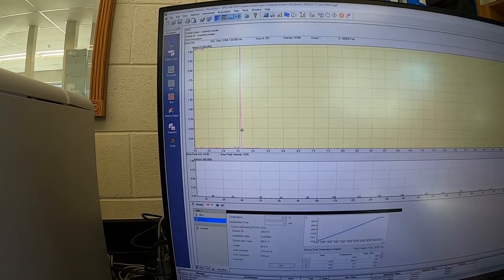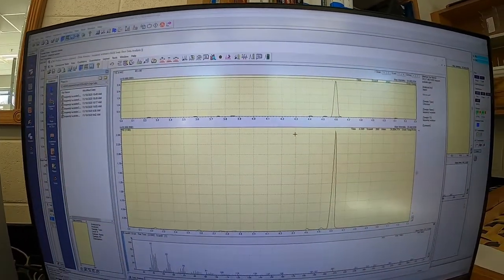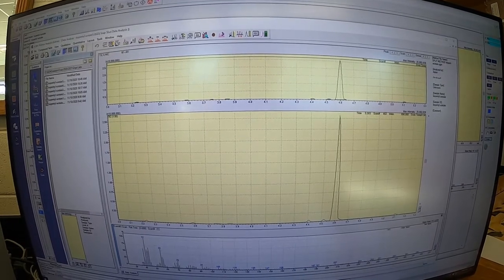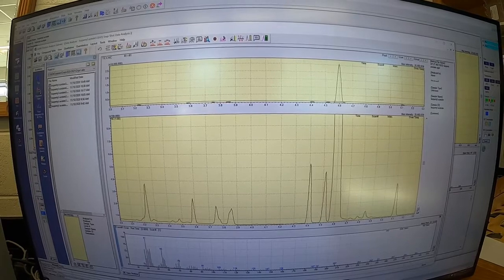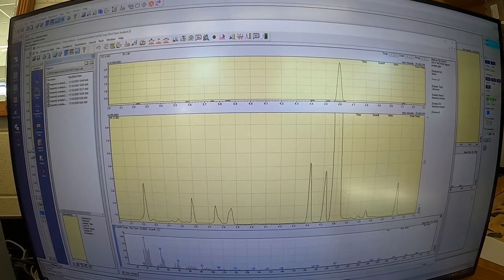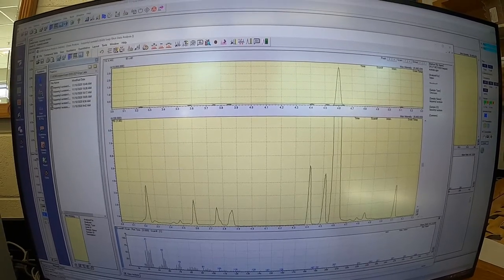So we can see one big peak there, and what I can do is go to the qualitative side of the software, and now it's a little bit more zoomed in. If I zoom in a lot on what's called the gas chromatograph side, we can see a lot of other little peaks. And those little peaks are probably impurities.